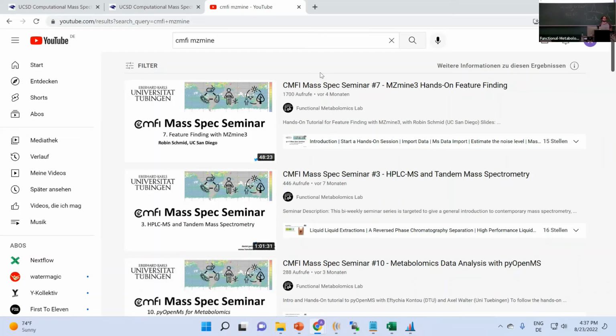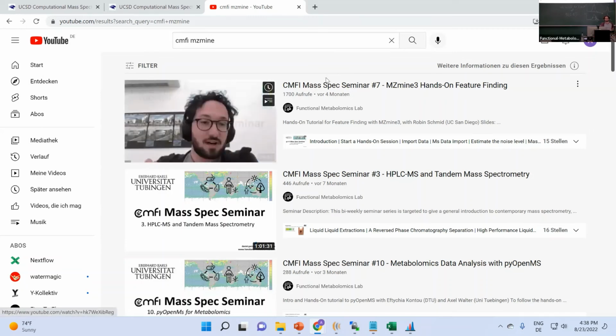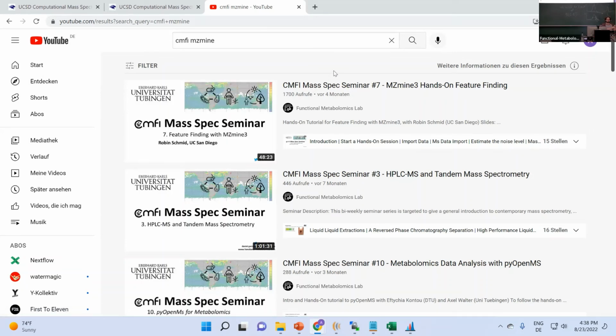It's usually easier then. And I just want to highlight, it was very confusing and many people struggle with this part. We're going to put this workshop online, but there are also some other workshops where we explained the same thing in a different way, and I think it's good to get there from different angles.